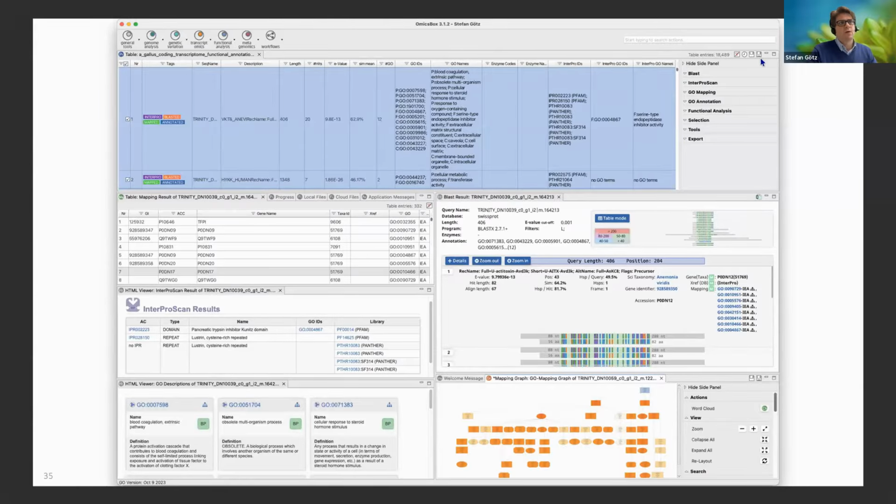What's the same is you can always save data, export data, and you have your side panel for downstream data analysis options. So you have always the export option, you have always a summary report option, and you have always a certain set of tools you can run on this table, okay? Still, all this can be used with standard bioinformatics formats, and it's all saved on your disk or in your cloud storage. So this can be easily passed around and shared. Those kind of things are available, obviously, as well.